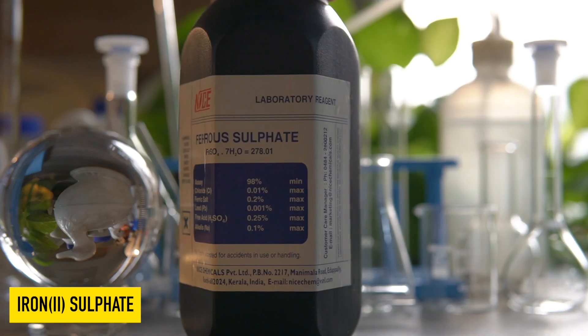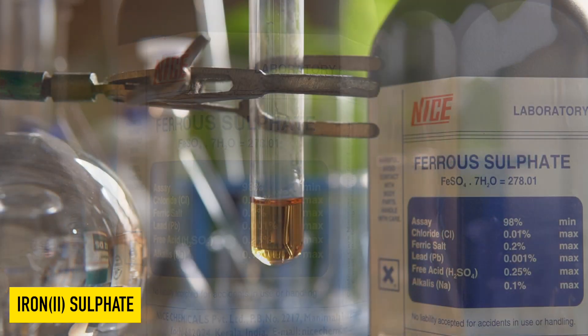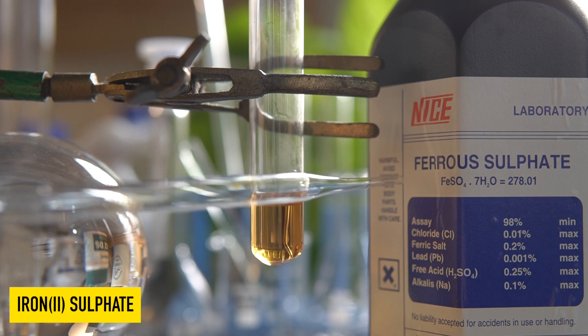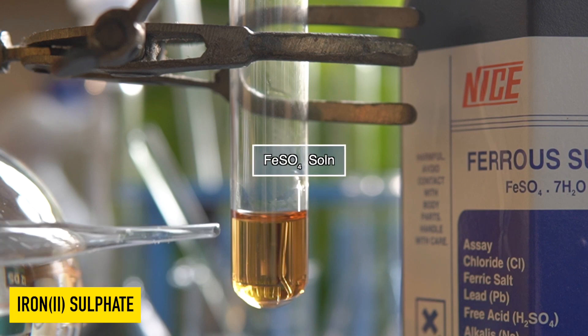This is hydrated ferrous sulfate; it is highly soluble in water. Now to initiate the chemical reaction, some amount of FeSO4 solution is taken in this test tube.